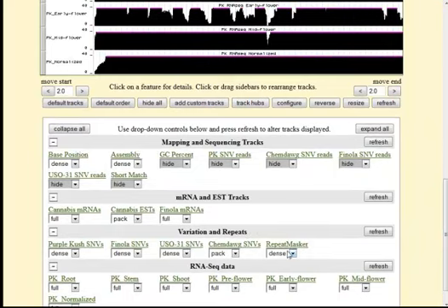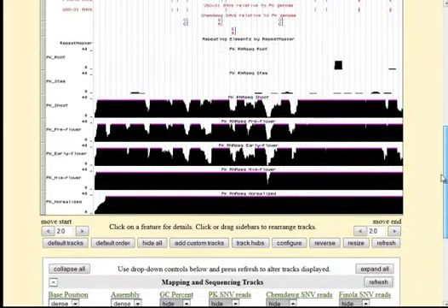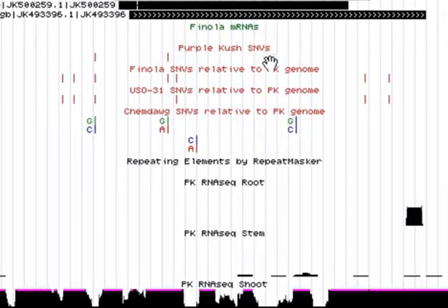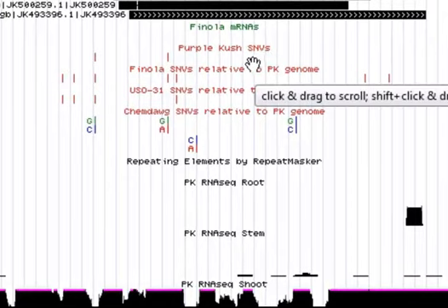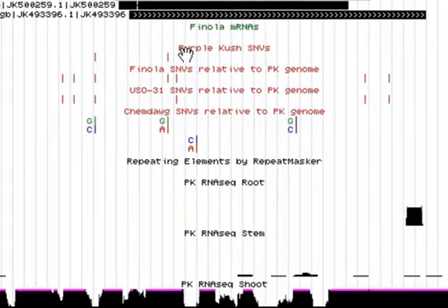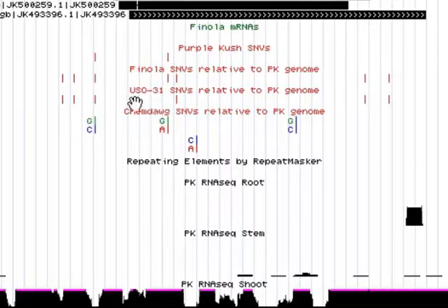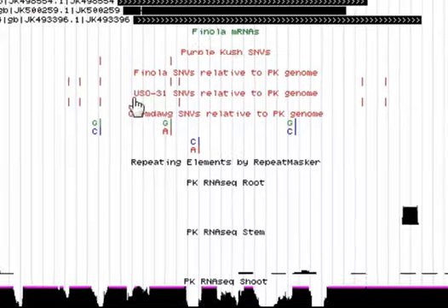You can turn on or off many types of data here, depending on what you want to see, using the UCSC Genome Browser tools you might know from other genome browsers. Another thing you might be interested in is the variations — simple nucleotide variations, also called SNPs. You might be interested in differences between the medicinal marijuana genomes; here we have Purple Kush and Chemdog. Or you could look at single nucleotide variations between hemp strains as well — there's a Finola hemp strain and another strain. You can explore things that make the strains different or similar using these variations.